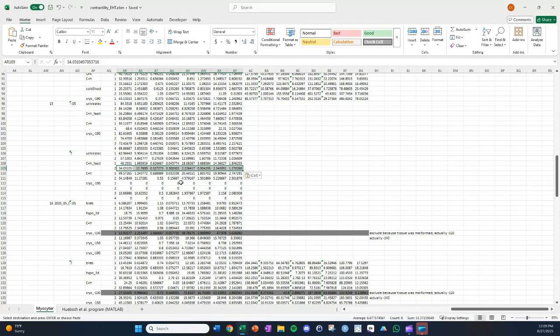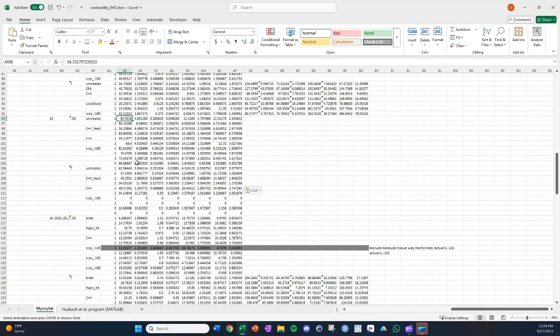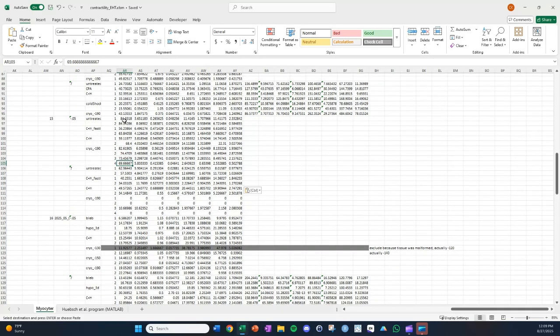Yeah, and then just to give some commentary on what we're seeing. So I think you might have noticed a lot of peaks appearing up in the analysis for this session. It's a bit unusual, some decent amount on the high side, I would say. Usually the beats per minute before the treatment is somewhere around 35 beats per minute. So we're getting double that within an expected range, but nonetheless, figured I'd point that out.